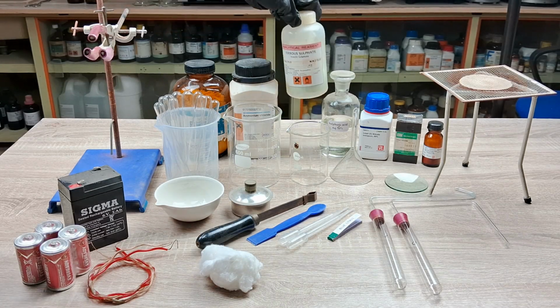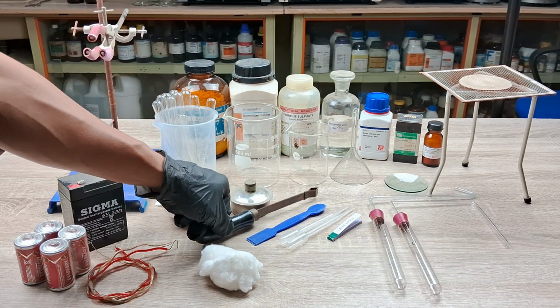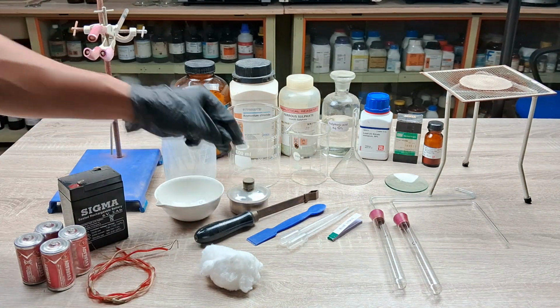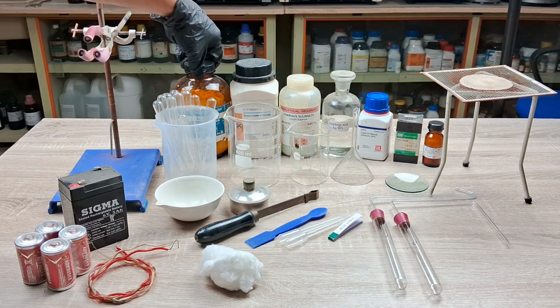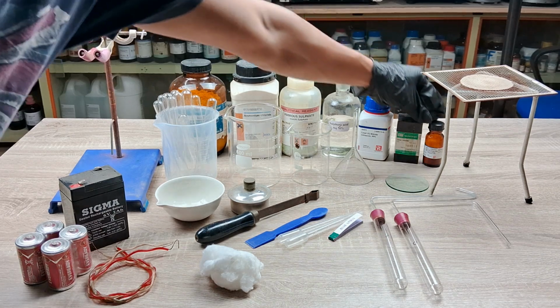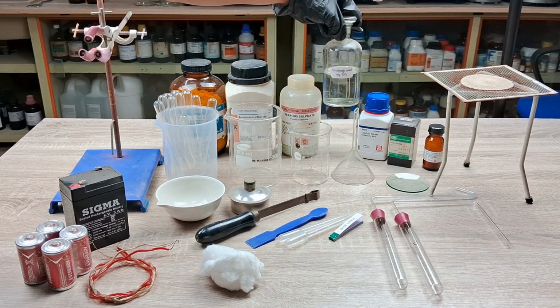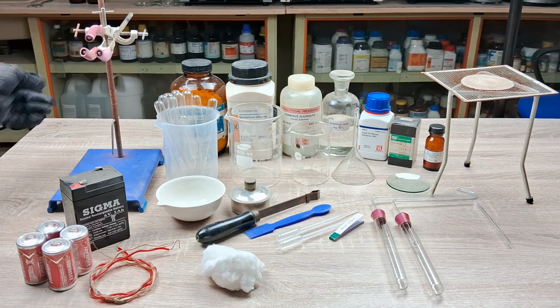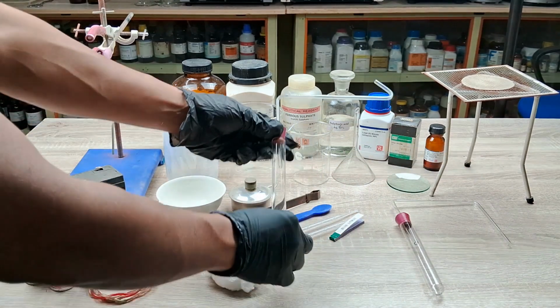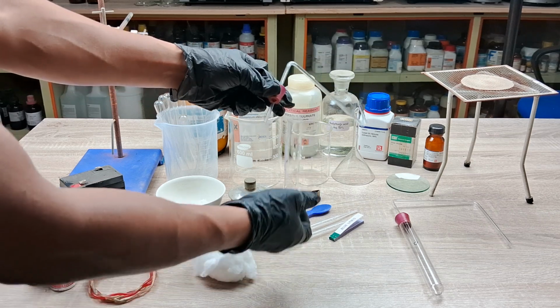To perform these experiments, we'll need the following: ferrous sulfate crystals, test tubes, test tube holder, spirit lamp or Bunsen burner, blue litmus paper, spatulas, lead nitrate, calcium carbonate, mercuric oxide, ammonium chloride, silver chloride, dilute sulfuric acid, plastic droppers, retort stand with finger clamp, an apparatus consisting of a test tube fitted with a one-hole rubber cork and a glass delivery tube bent in 2 places as shown.